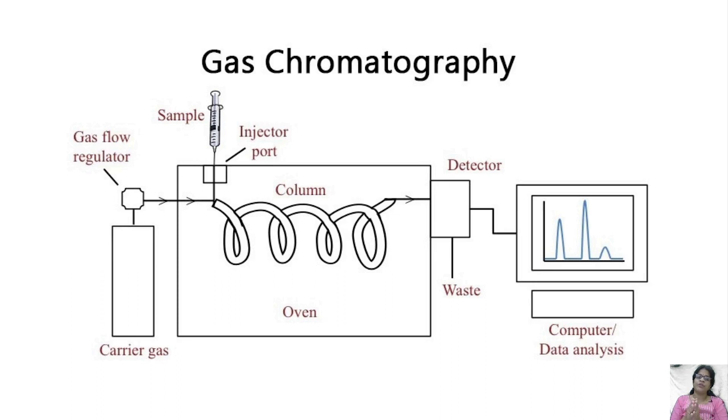What happens in gas chromatography? How do you detect the peaks? Same as HPLC, you will be getting peaks, and based on the current that is generated, you'll be getting the concentration and also the retention time in gas chromatography. So this is the simple procedure of gas chromatography.